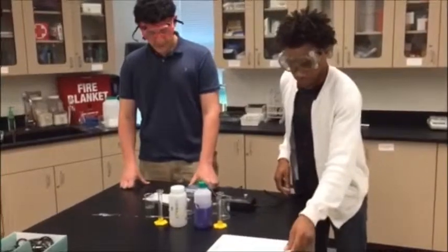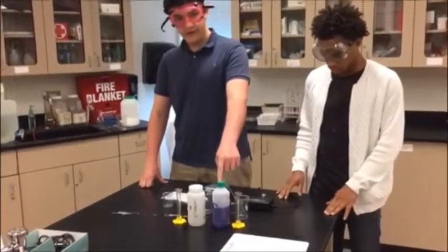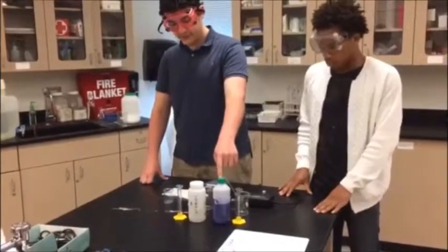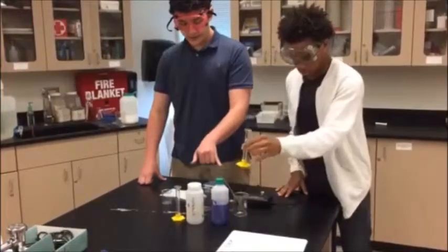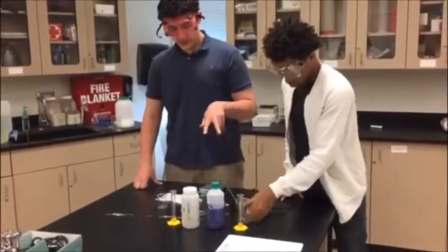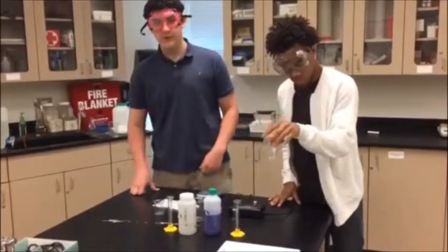And so what we need for this lab is a LabQuest, a SpectroVis, 2.5 × 10⁻⁵ molar crystal violet solution, 0.1 molar NaOH solution, two 10 milliliter graduated cylinders, 3 cuvettes, two 100 milliliter beakers, and then a 50 milliliter waste beaker.